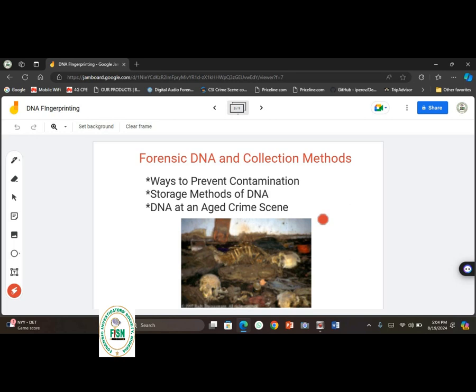You know, the last time when we were demonstrating how to collect samples from the crime scene, I told us that we should be careful while packaging, that we should use PPE equipment to protect our DNA from being transferred to it. And each time we touch different items from the crime scene, we must change our gloves so that we do not transfer DNA from one object to another.